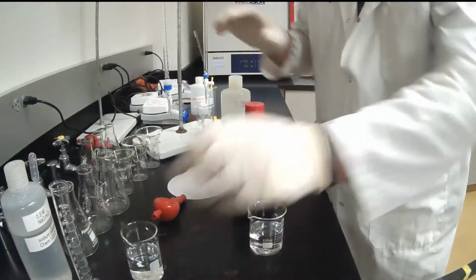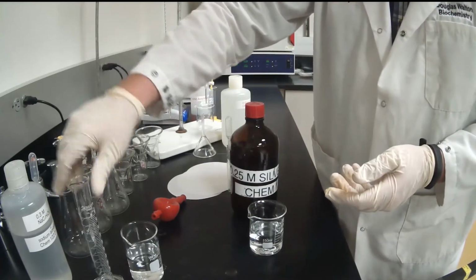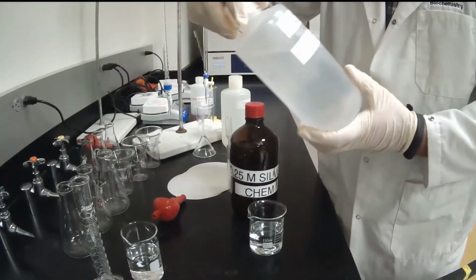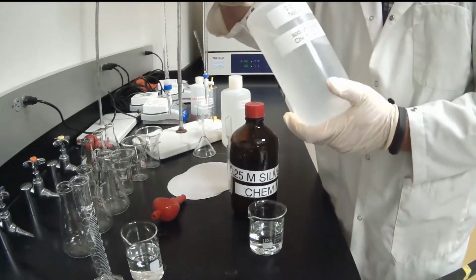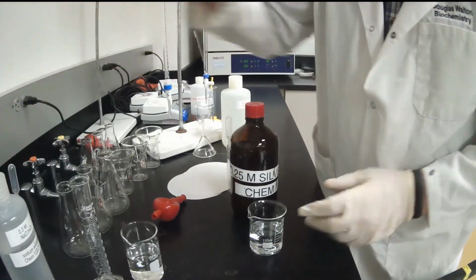Okay, so we've rinsed both of those. I've already took the liberty of rinsing this graduated cylinder with my sodium acetate. I'll make sure it's sodium methoxide. Sodium acetate. So we are ready to do our aliquots.